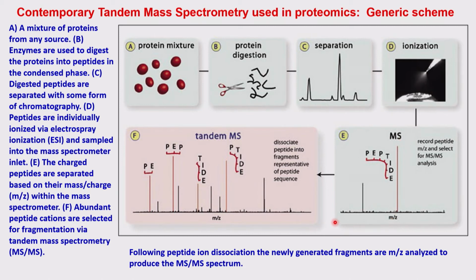All the mixture, whatever you have, each one. Then you can pick up any one of these, this one, etc. Do further mass spectrum as such, so that you can do the mapping. You can do the sequencing also.